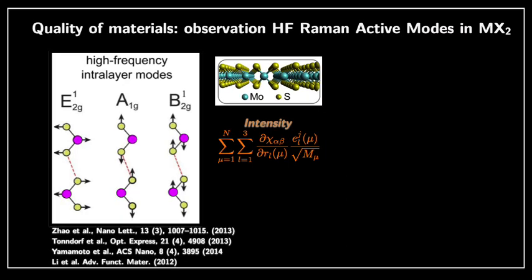So the material of choice currently, and materials of interest, is MX2, so metal dichalcogenide. So M is a metal and X is a chalcogen. An example of which is molybdenum disulfide. You have a little representation of the crystal shown in the middle of this slide.